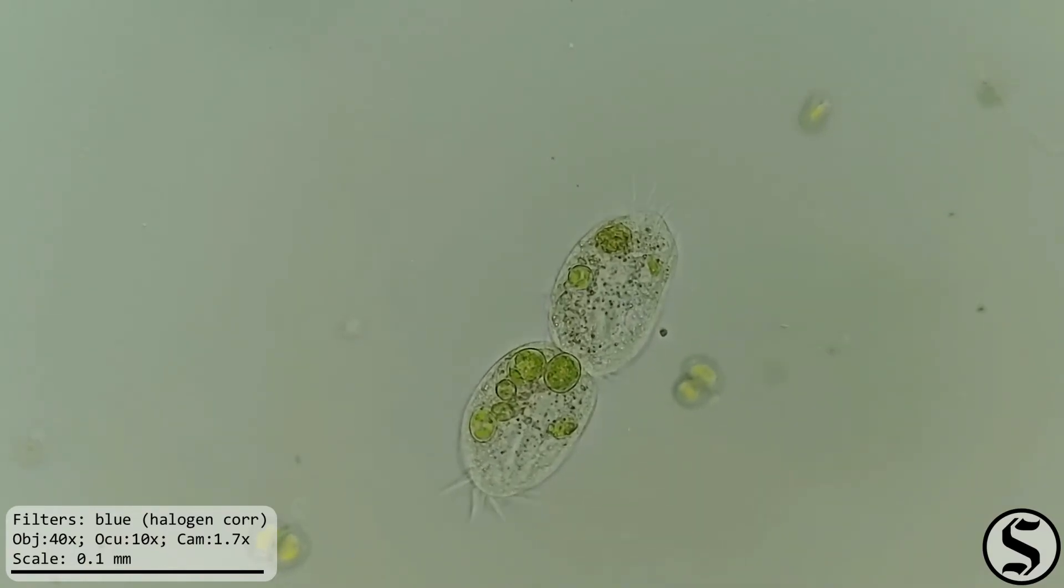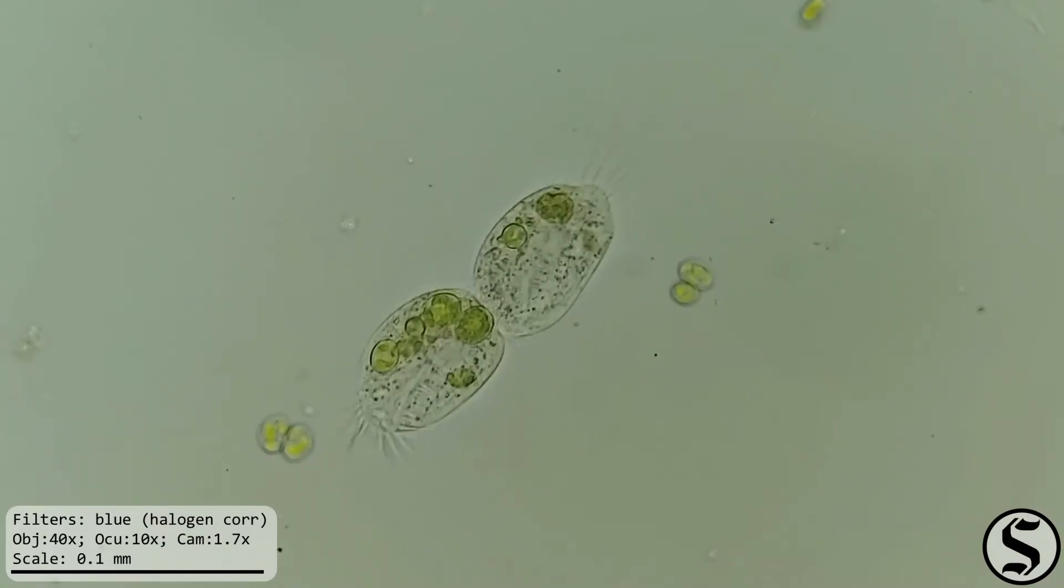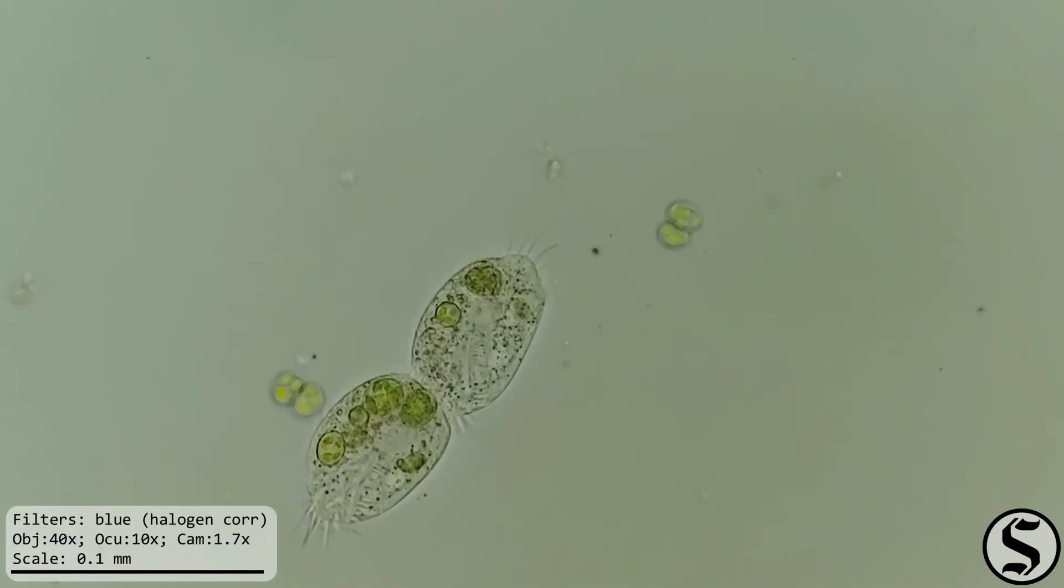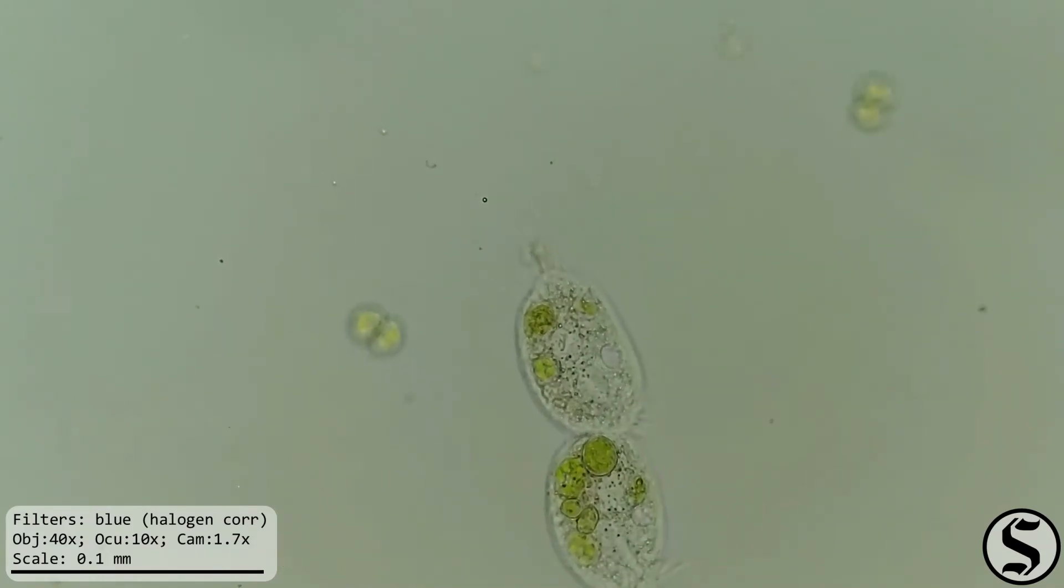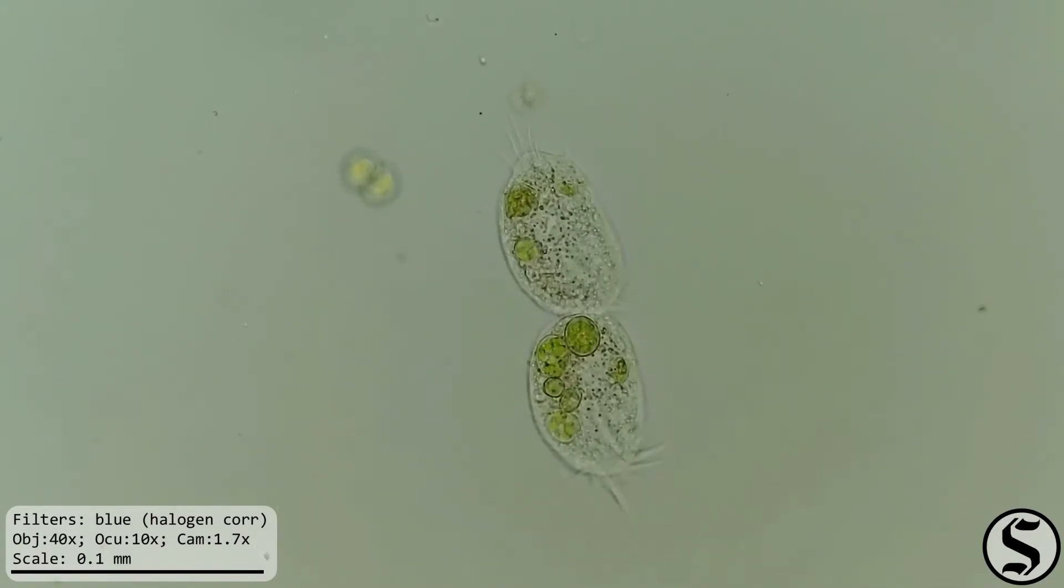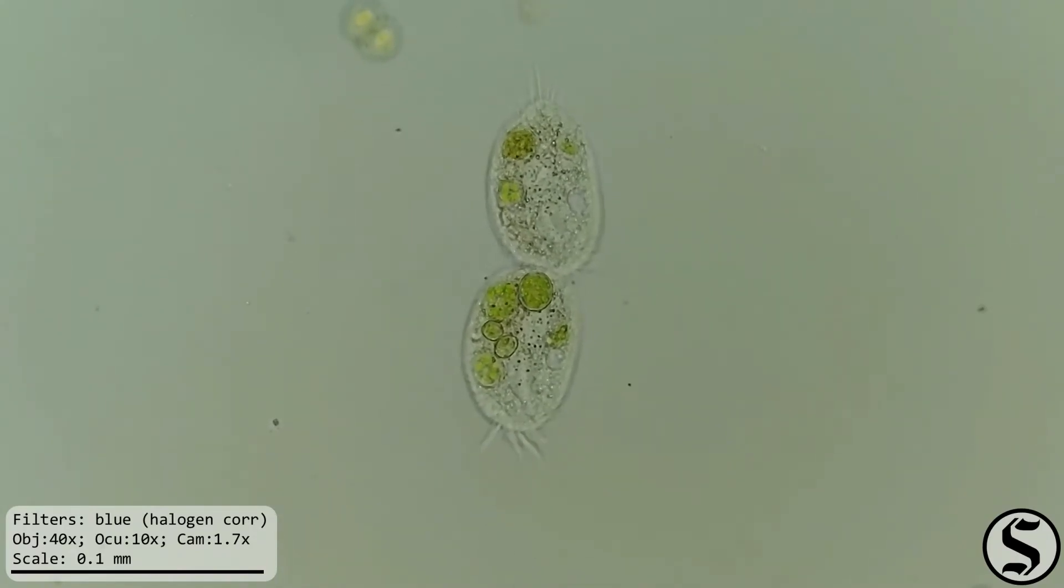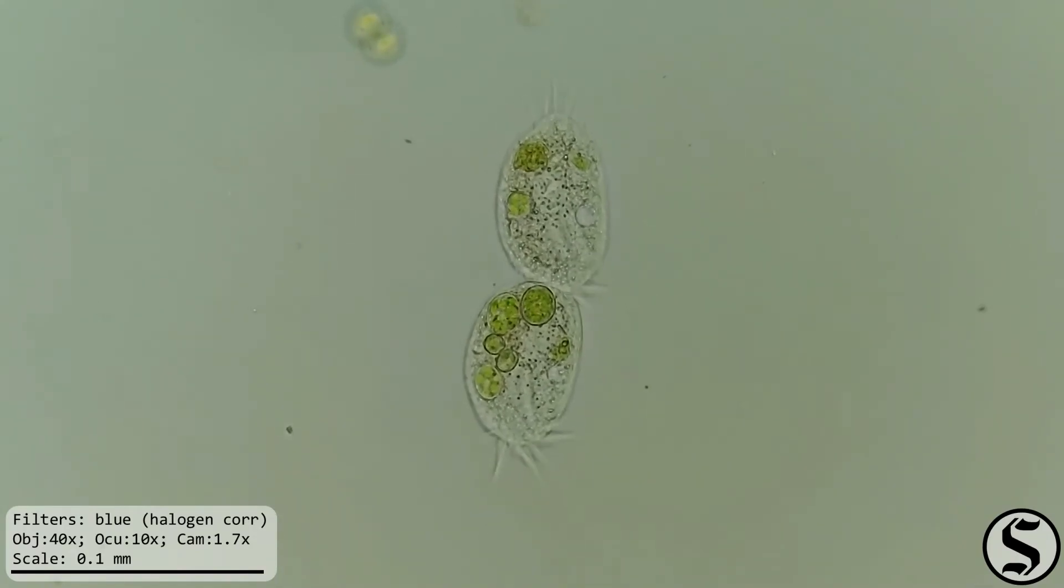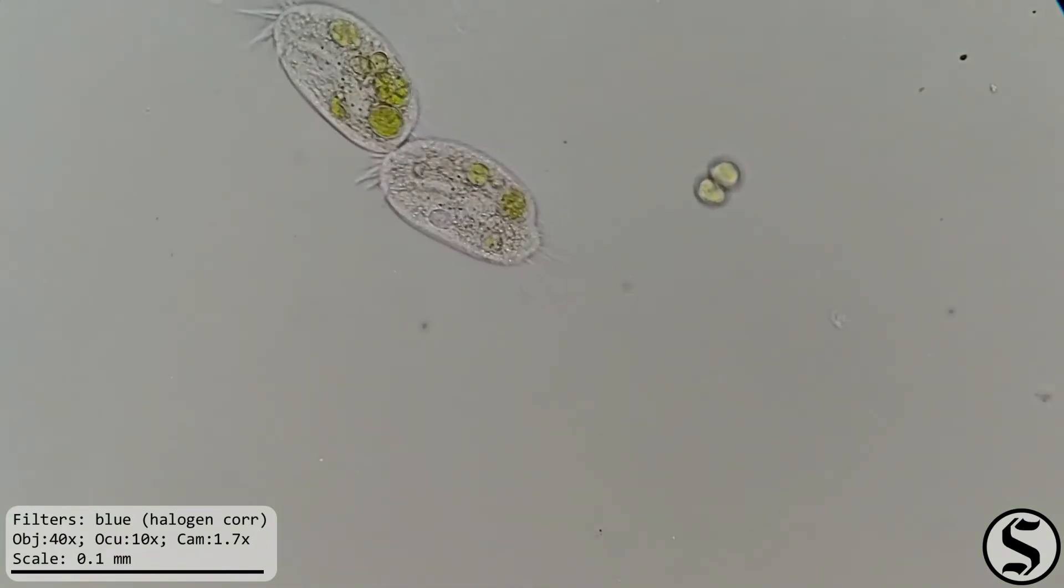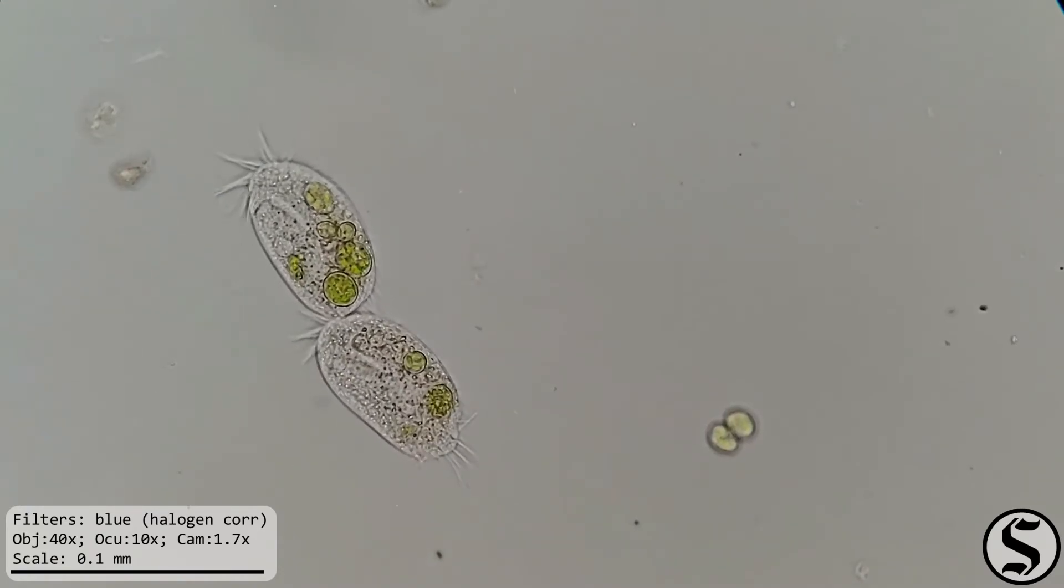As we continue to watch, there's starting to be a very clear division between those two halves. I started thinking of the one in front as kind of the piglet because it took most of the green algae for itself, but there's plenty around in the sample. I'm not worried about it. I think it's really interesting that the way they divide is with them both facing the same direction, and each one of those twitchy movements I felt like brought them closer to dividing.